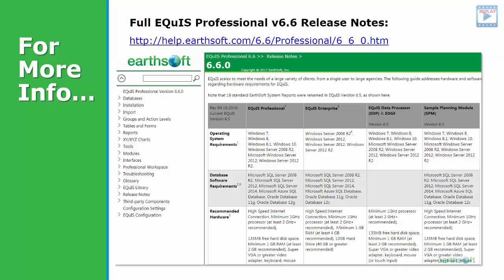So that is how they're linked. They're linked with that combination of, I can't remember the four combination off the top of my head: sample ID, analytic method, CAS number, fraction. So it's not looking at the batch ID information or at the test type, I believe.